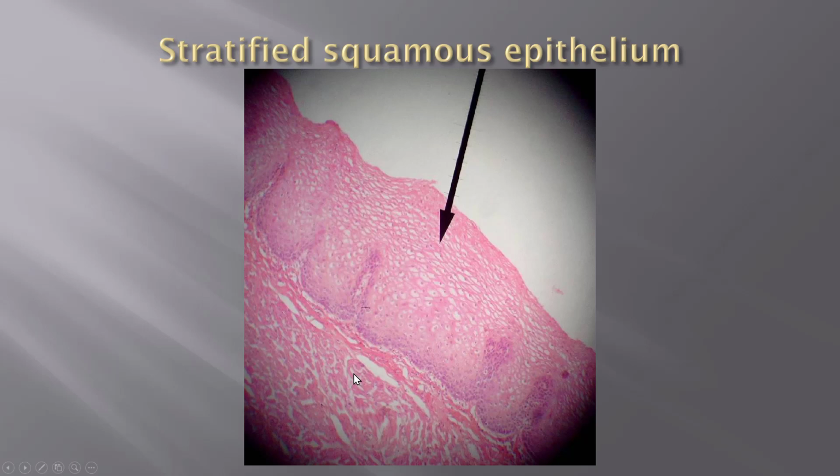And then you change into a different type of tissue that we're going to talk about next when we get to connective tissue. But you can see that this is multiple layers of this tissue, and that is what skin is made of. These are stratified layers of squamous epithelium. We're going to learn this. This is the stratum corneum. These layers have different names, but this is a very protective type of tissue that we need to protect us against abrasion.